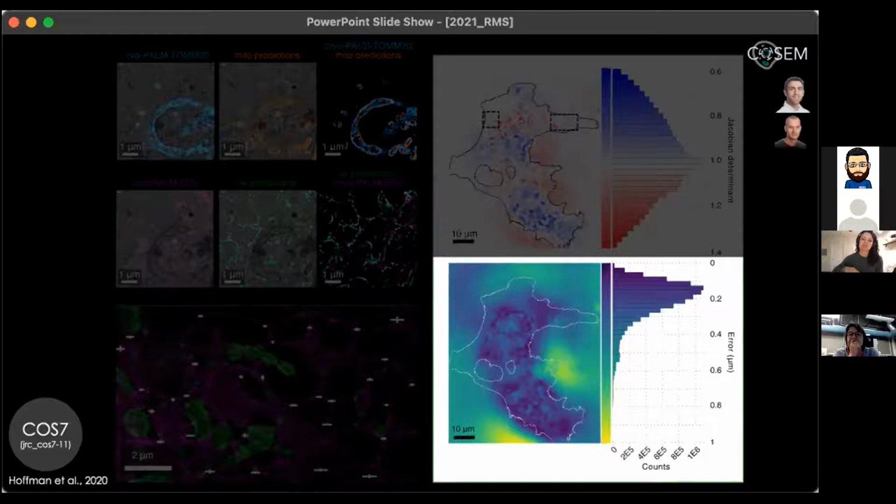The extent to which the alignment process can be automated really depends on the quality of the data, always, right? So sometimes we'll have to manually tweak things such as masking out a cell that is not transfected in the light, or in the worst case scenario, just doing a manual alignment task, but using the segmentations as a guide. And I can say, having personally had to align several of these data sets with and without segmentations, that even having those segmentations is a huge help for this.